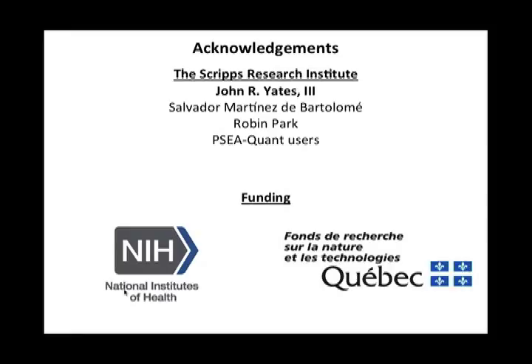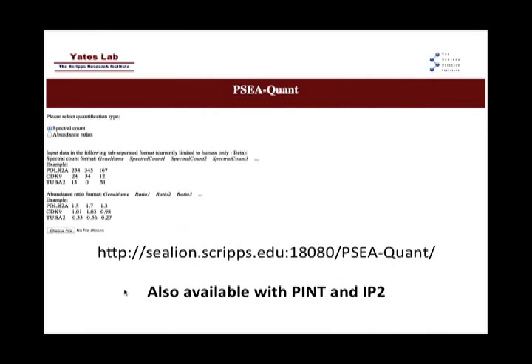Some of the future work regarding PSEA-Quant: as I said, we are looking at the addition of COPA-KB and the OMIM disease association database for the analysis of PSEA-Quant. Another important aspect is that we're looking at the addition of an algorithm for protein set similarity-based clustering. And what do I mean by that? A lot of the protein sets that can be reported by PSEA-Quant might be redundant if they include several of the same genes.